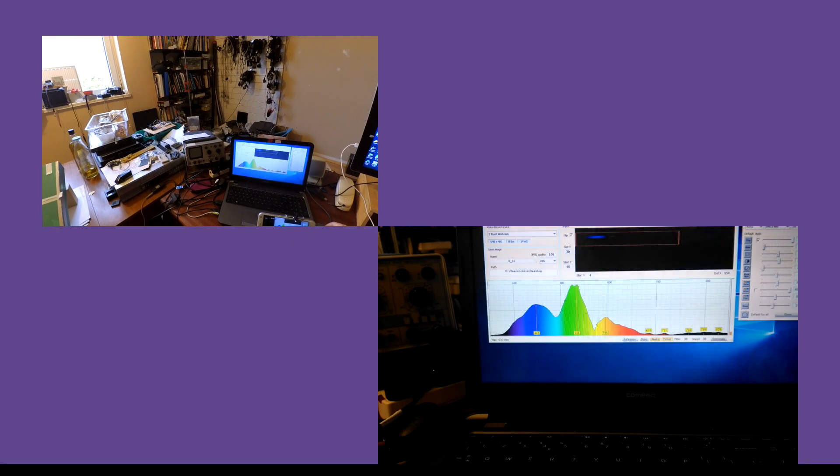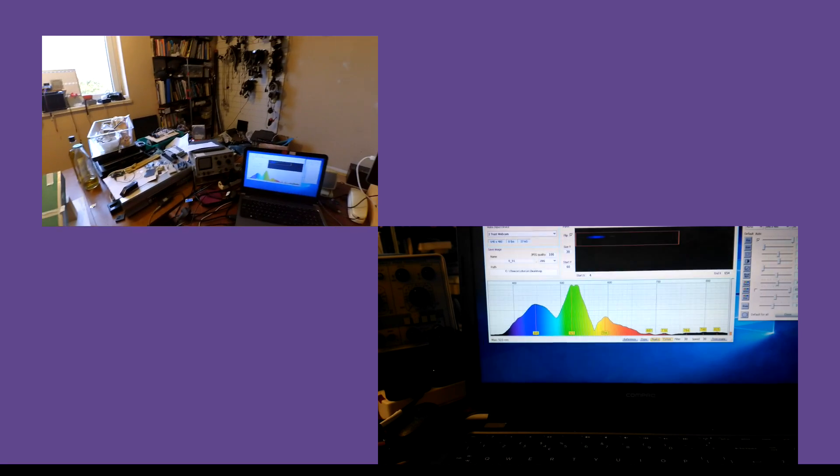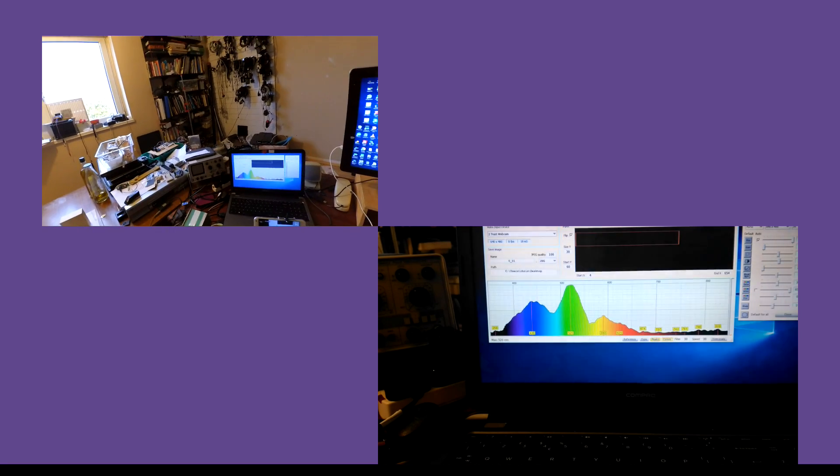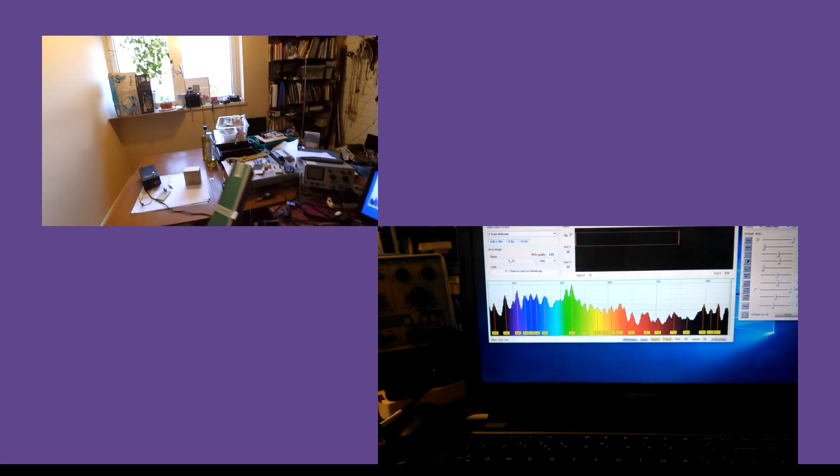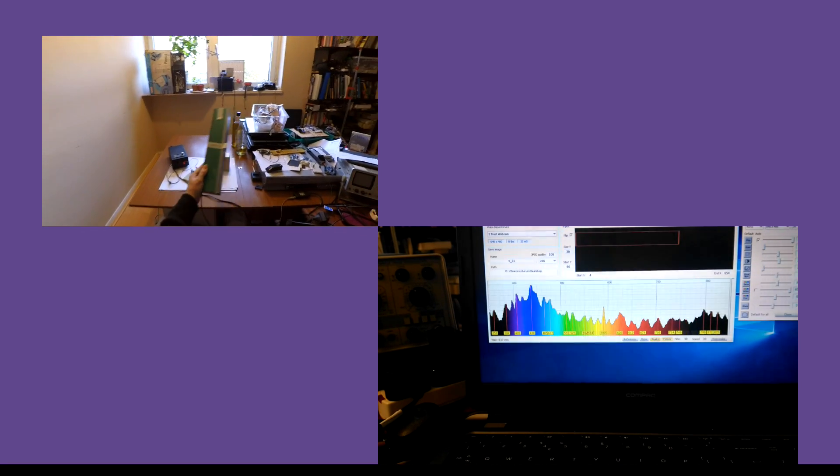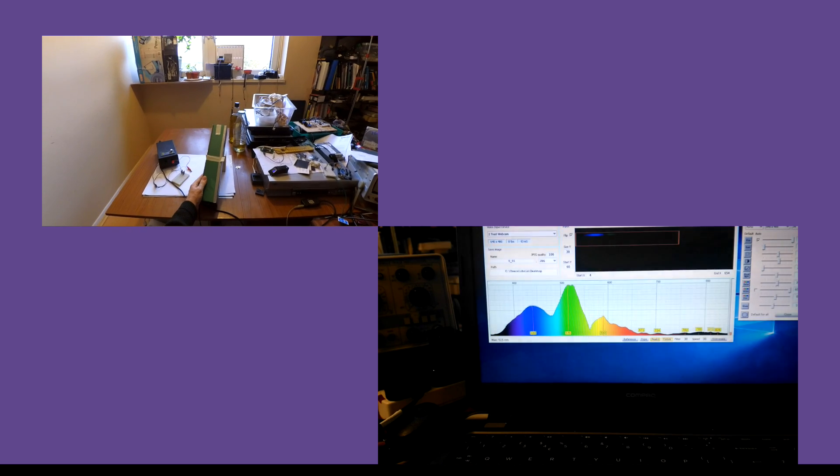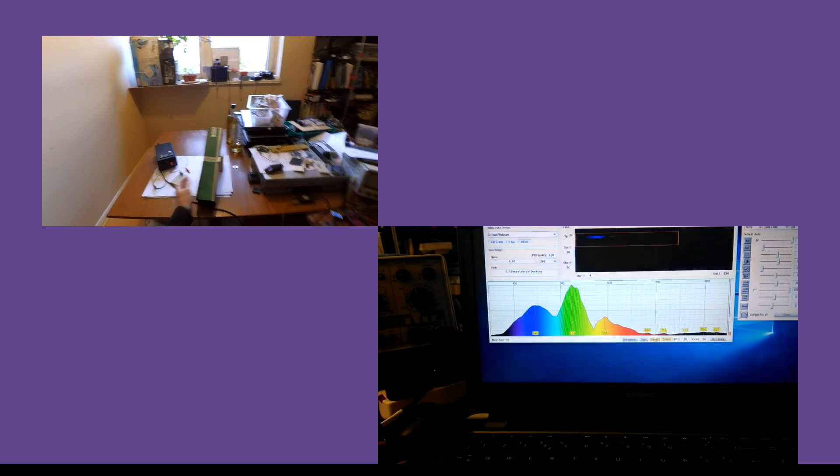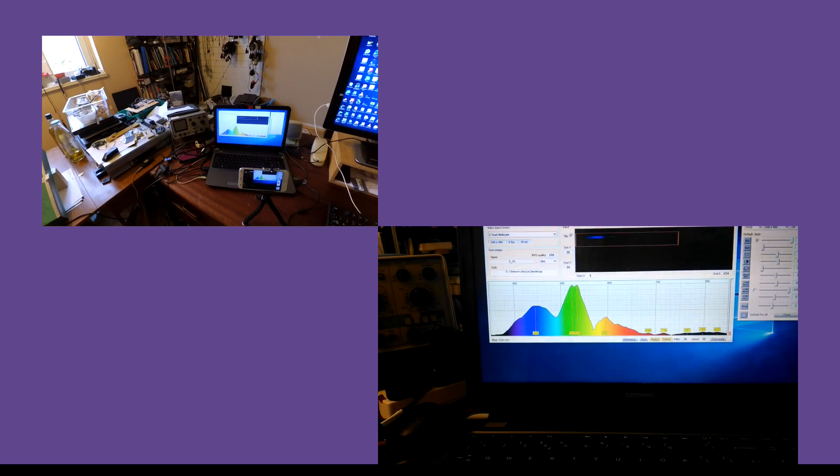So you plug the spectrometer in and you fire up the software. You're wagging it around, and this is what you see when you point the thing out of the window. Like that. You see a spectrum like this.